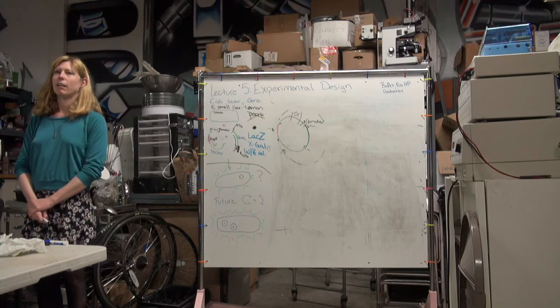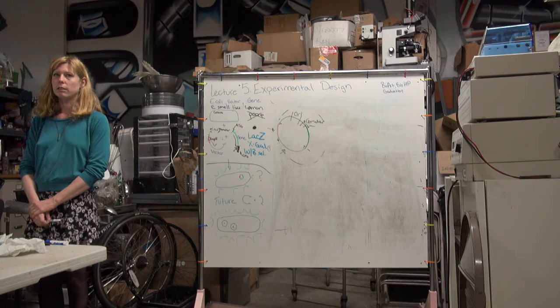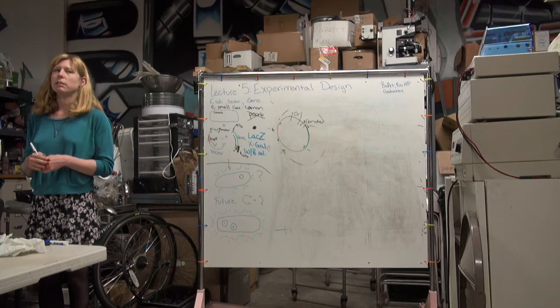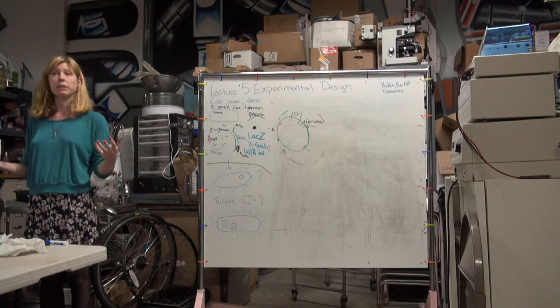Marie, I have a question from Jeff. He said, is a single blue-white screen sufficient, or should we plan on doing more than one? I believe that's in the experimental control. So the question is if you'll need to do more than one differential screen.